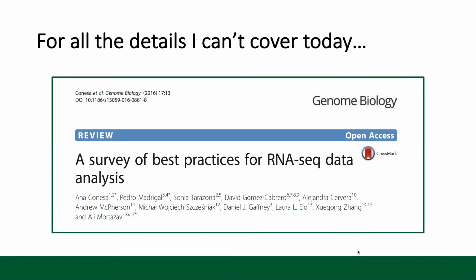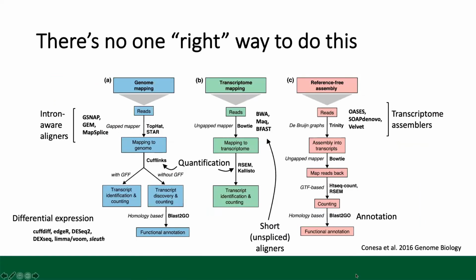Another caveat for this talk is there's really no right way to do an RNA-seq analysis experiment. It just depends on your data. There are so many pipelines and tools out there to analyze your data, and a number of papers have been published comparing those different types of tools. So I would suggest you go into the literature and take a look around and see which ones seem to appear correct for whatever data you have available.